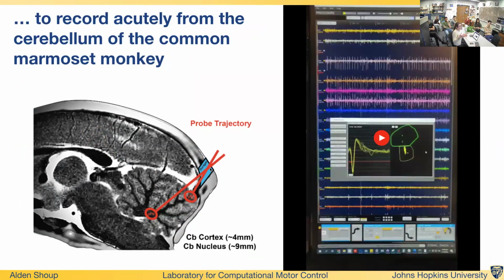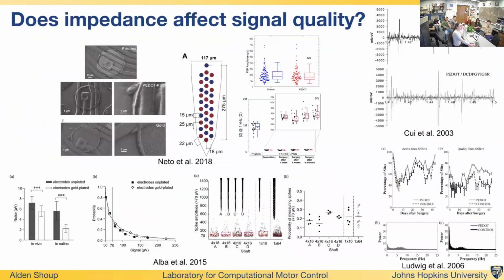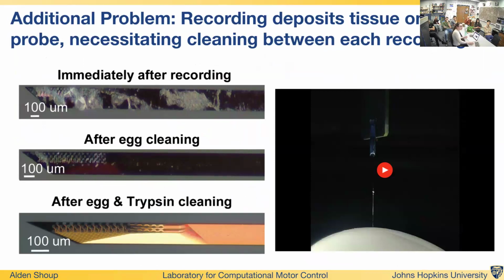But your trajectory through the Duragel, which is important for targeting the right structure, can be affected by any of this debris or fibers on the probe. And so when your probe looks like this, a little gunk here might get stuck on the Duragel and divert your probe left or right, depending on which direction you're pushing it. And so this debris becomes a big problem for us.